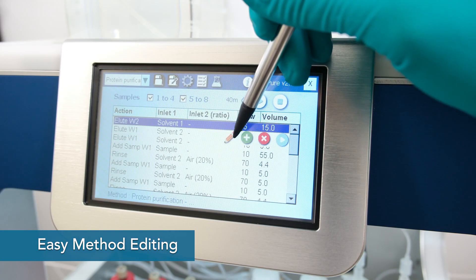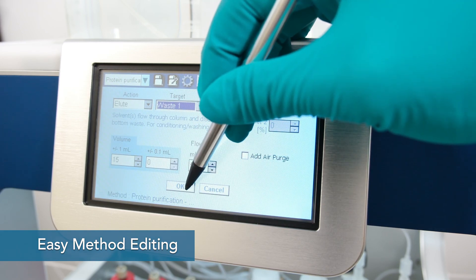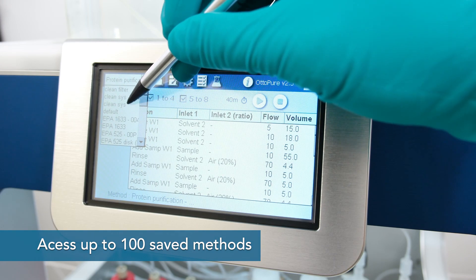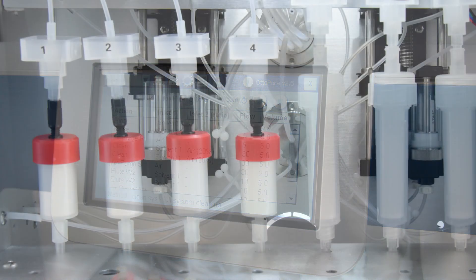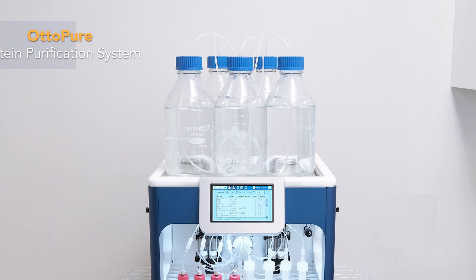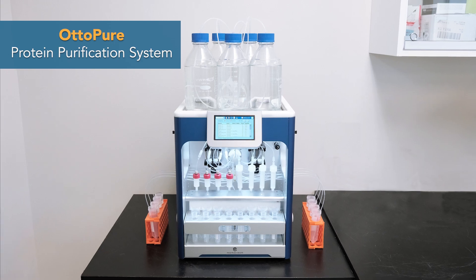Easily create and edit your method steps and access up to 100 saved methods. The flexible and versatile design of the OttoPure makes it a high-throughput solution for many types of protein purifications.